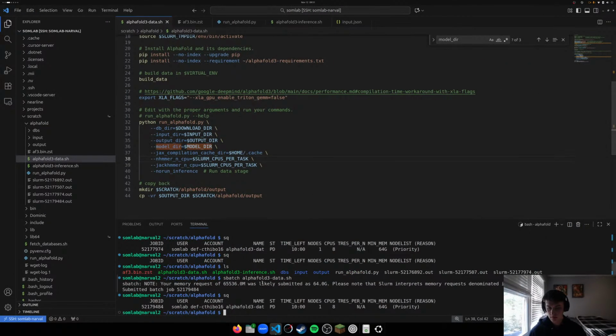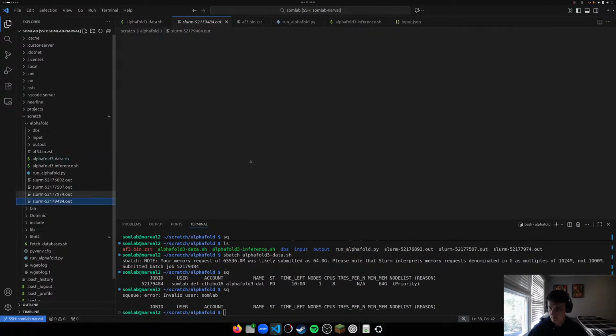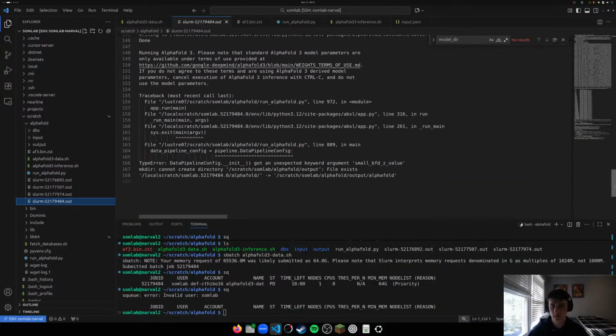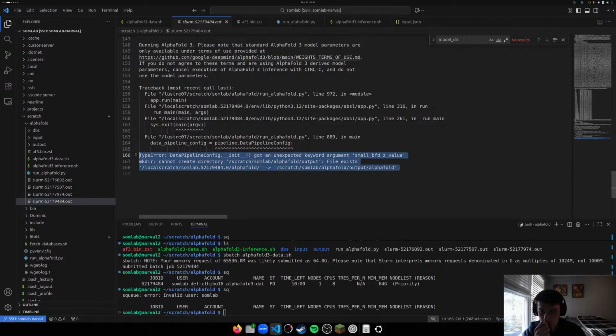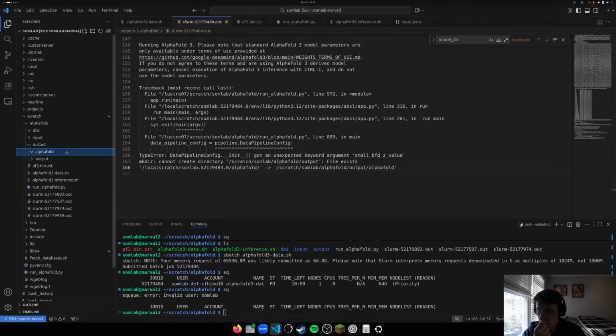All right. So this got done, it seems. Okay, we still got the same error as last time. What?